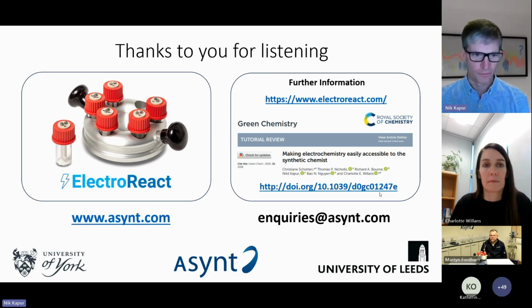And I think what Charlotte's also demonstrated in the website was we've come up with a model that should help you move up in scale or down in scale if you really wanted to between one size and the other. It is quite specific to the Electro React because some of the assumptions you have to make are about the degree of mixing, but between our 2 sizes, I think they're fairly good assumptions.